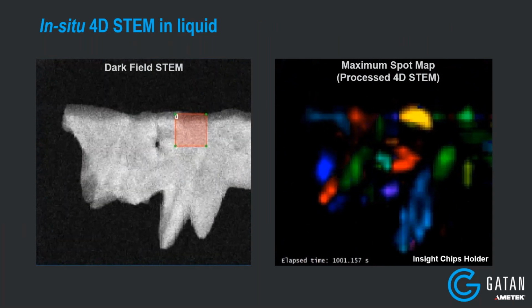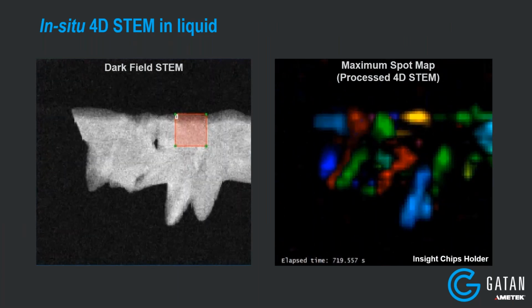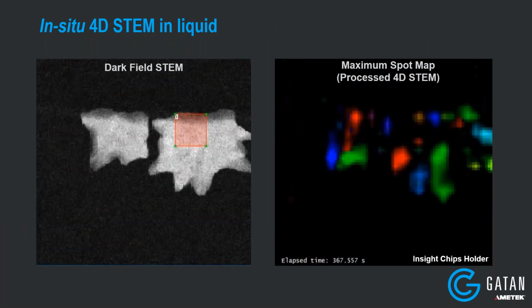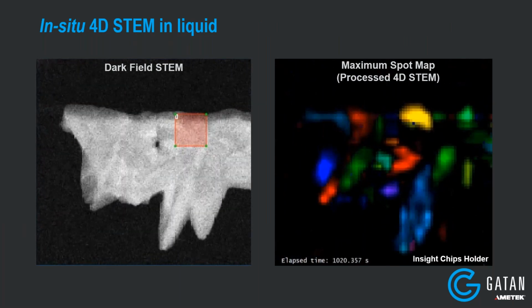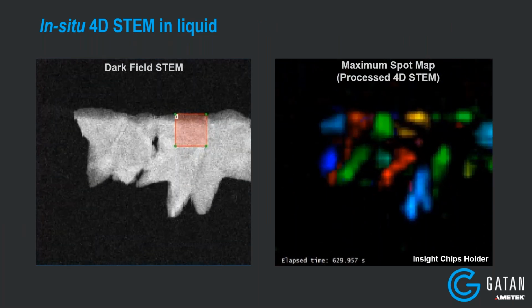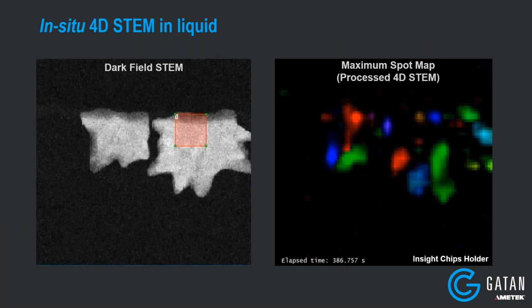And so we can watch in the STEM image, we can see the morphology of these particles. We might be able to determine the growth rate of these. But it's more difficult to determine where are the grain boundaries. These are polycrystalline, not single crystals. And so it might be difficult to determine just from the STEM data, certainly at this resolution and with this very large field of view, to determine where are the boundaries of these crystalline regions.